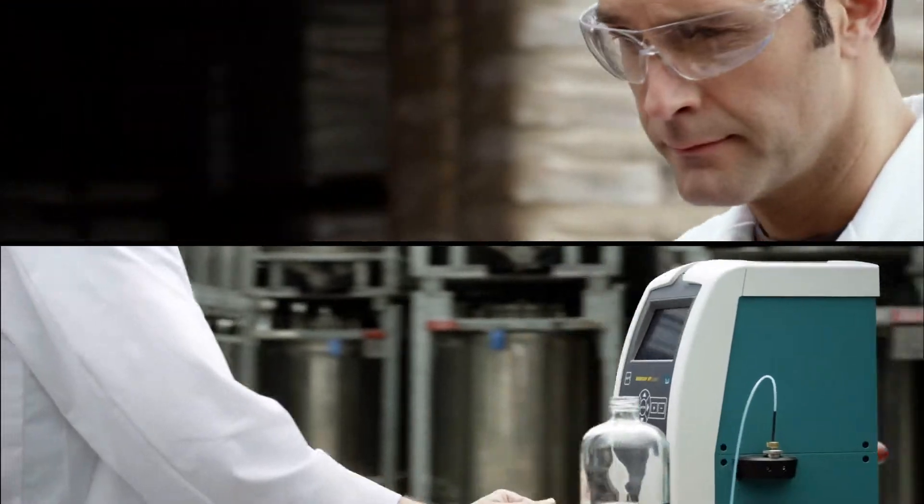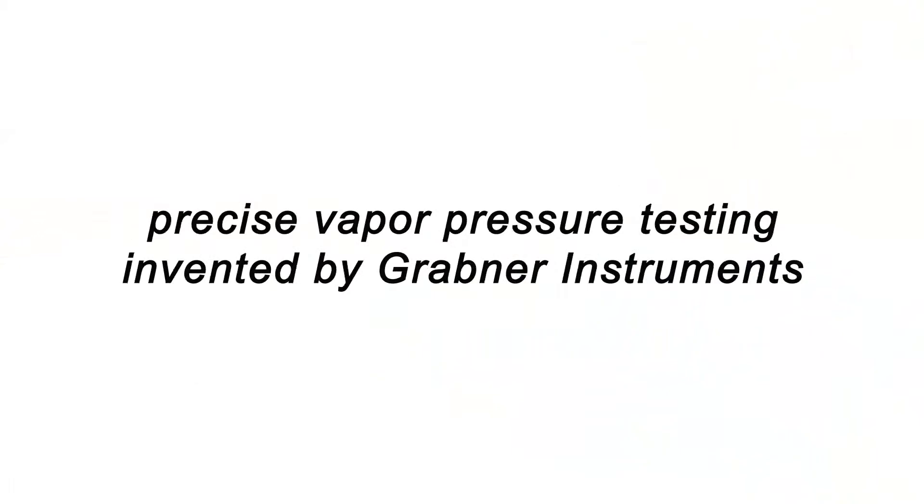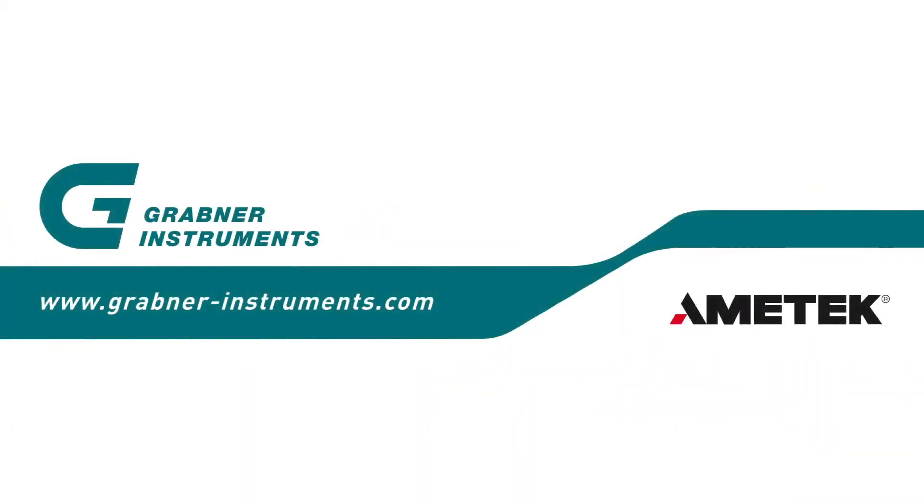This unit has everything that's needed. It is the best package for vapor pressure. Precise vapor pressure testing invented by Grabner Instruments.